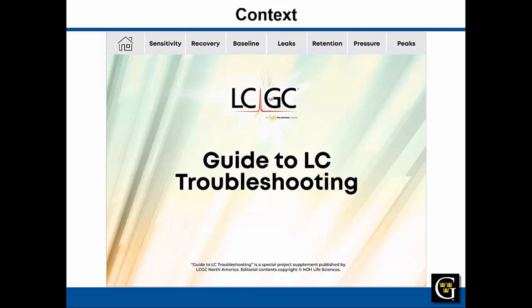Now, one of the resources that LCGC offers for LC troubleshooting is the so-called wall chart. This is a snapshot of an electronic version of the wall chart, so you can literally get a paper copy to hang on your wall, but there's also an electronic version that has the tabs shown here with different topics related to sensitivity recovery, baselines, and so on.